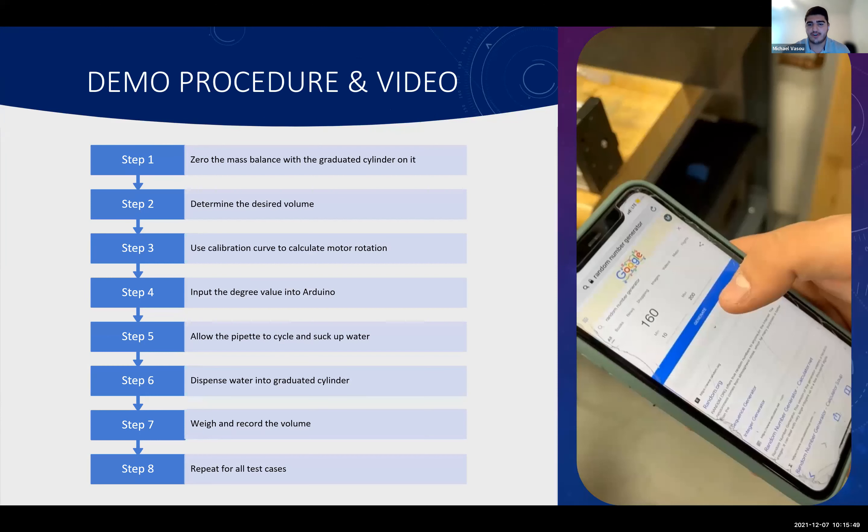So before we get to the video on the right which showcases our final design, just a little bit about the procedure, about how we went on to test each case. So first we started out with the graduated cylinder, put it on the mass balance and hit the zero button. We determined the desired volume we wanted to reach, went back to that calibration curve I just discussed, found out what degrees our volume corresponds to, put that into Arduino, allowed the pipetter to run through the process, dispense the water back into that graduated cylinder, and then we were able to weigh and record the volume. This process was repeated for all the test cases. Like I said, the video on the right goes through the steps basically. And also it is important to note that we do not have the final motor housing on top of our design, just so we can allow everyone to see the internal components move and how they work.